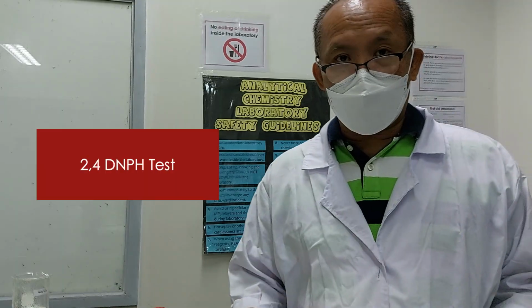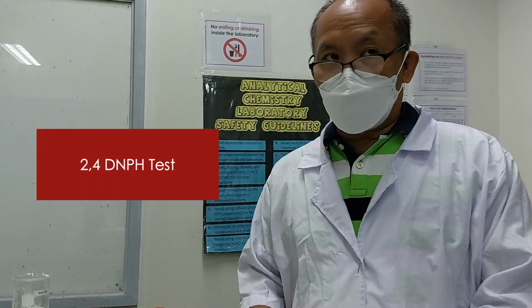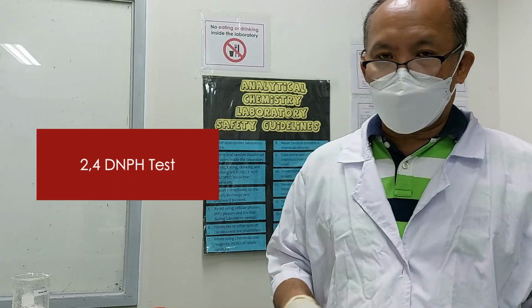Now, another important test for aldehydes and ketones is the reaction with DNPH. You call that 2,4-dinitrophenylhydrazine. The reaction is nucleophilic addition-elimination, and the expected product is a reddish orange precipitate. Since aldehyde and ketone have carbonyl group, both will react.